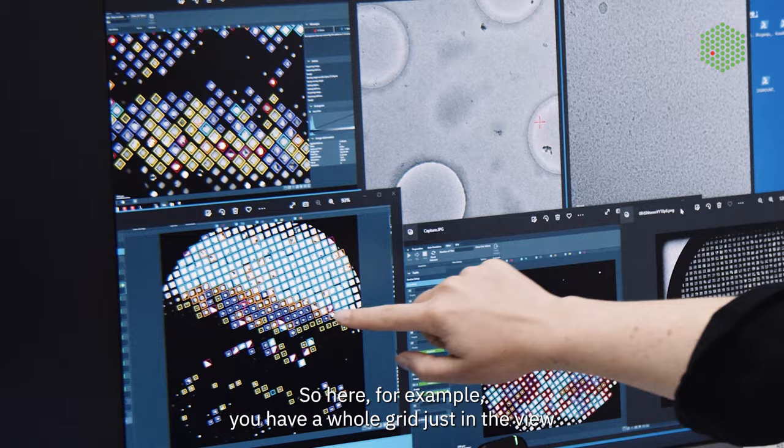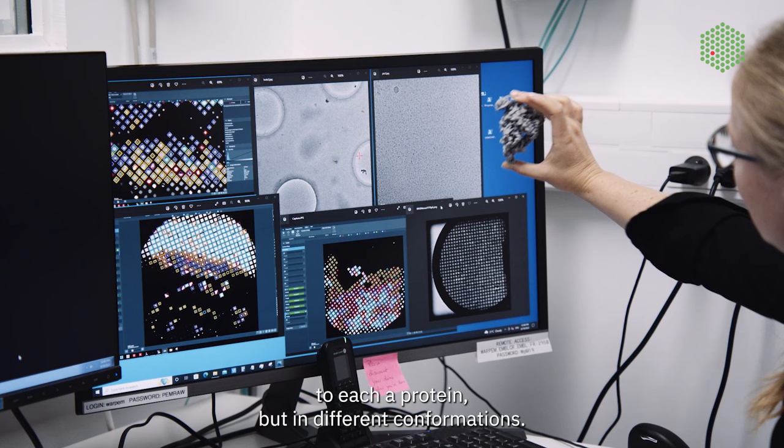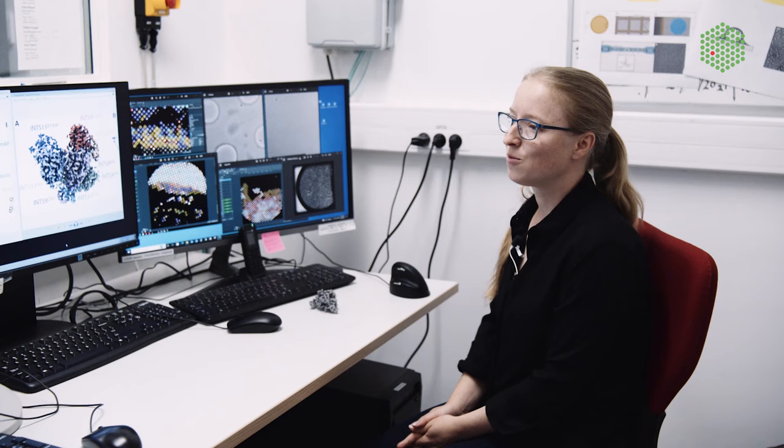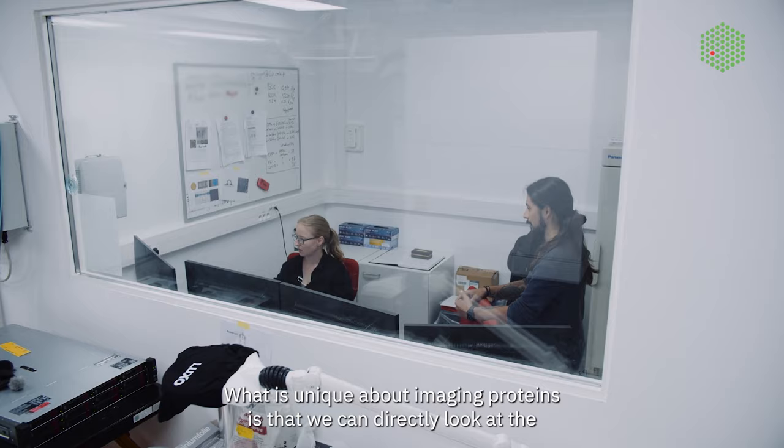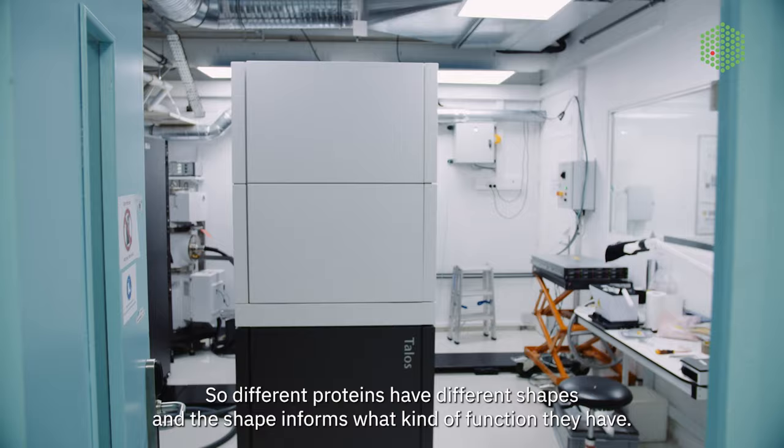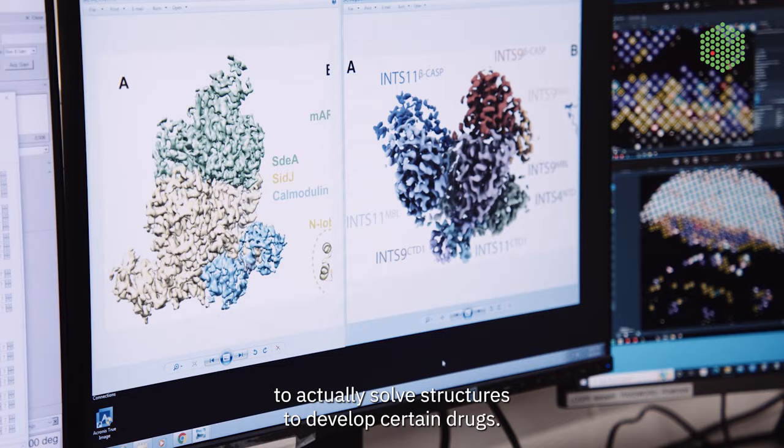These samples that Victor prepares are here. So here, for example, you have a whole grid just in the view that you would see in the microscope. And these dots that you probably can barely see correspond to each protein, but in different conformations. And this is how we can solve it in three dimensions. What is unique about imaging proteins is that we can directly look at the structure of the protein. So different proteins have different shapes, and the shape informs what kind of function they have. Cryo-EM is useful, for example, for the spike protein of the coronavirus. And in general, Cryo-EM is more and more used in industry to actually solve structures to develop certain drugs.